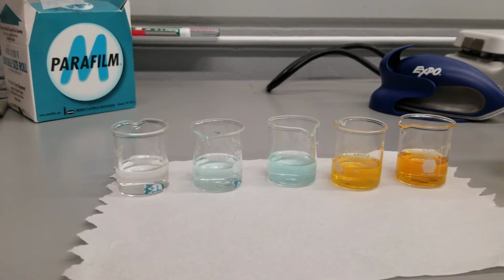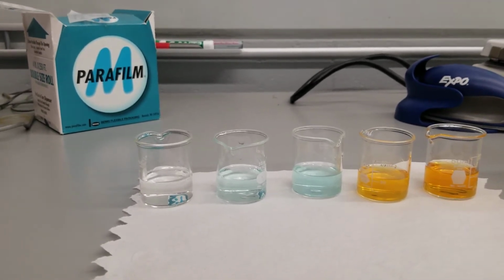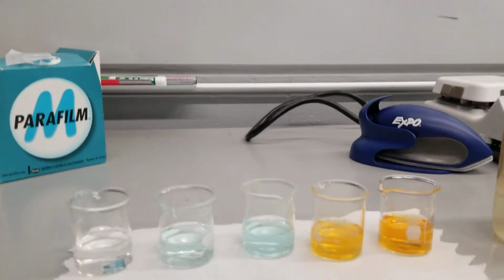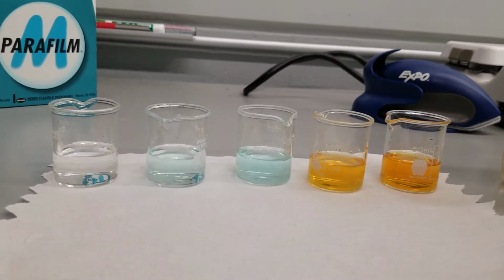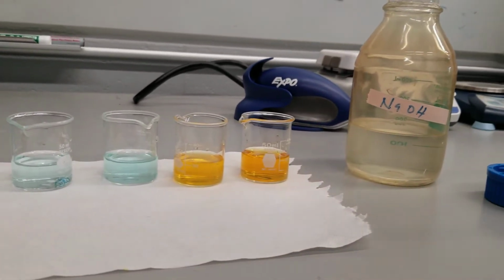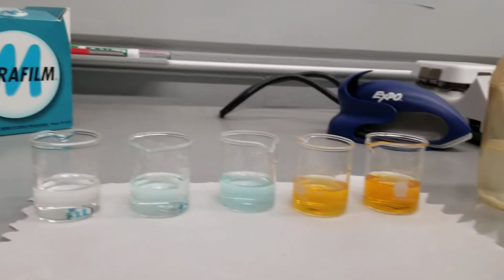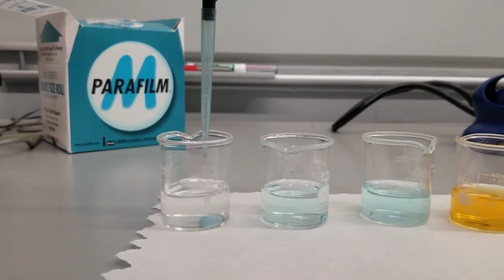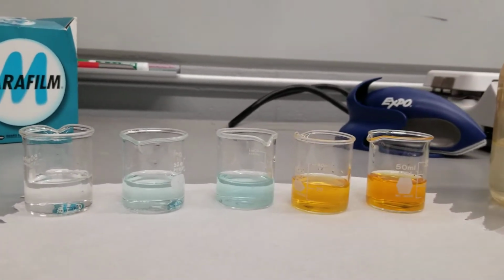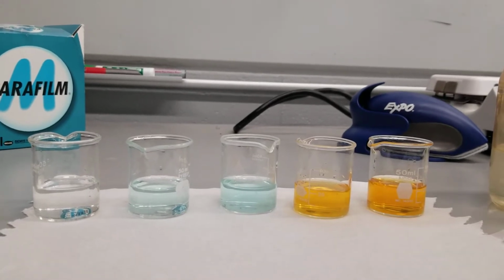So if you suspect that you have high amounts of heavy metals in things like well water and so forth, it's a very good way to test to see if you actually do have them present. Different heavy metals behave differently with this reagent, which is simply caustic soda, sodium hydroxide. If you add concentrated sodium hydroxide to water, you expect to see a color change. Here's our control. There's no heavy metal there, and we do not see any color change essentially, which tells us that it doesn't contain any heavy metals or high amounts of heavy metals.